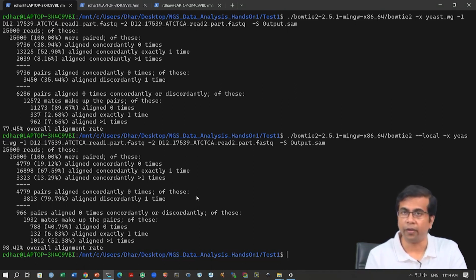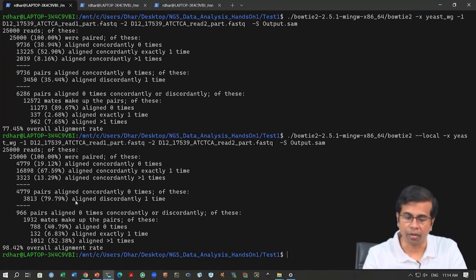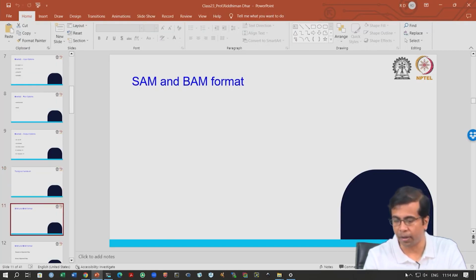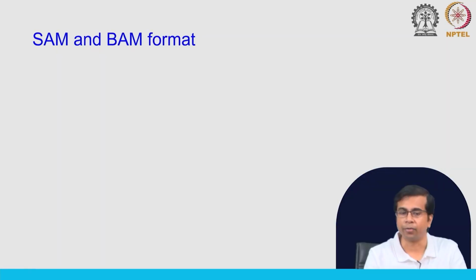Okay. So, I will first go back to the presentation. I will just mention some of the terms, because I do not want to show the file immediately, because you might get a bit confused with all the information in there. So, let us go back and I will introduce this SAM and BAM format, and then we can come back and see what you have in the actual data.